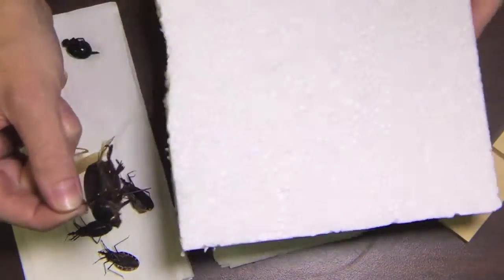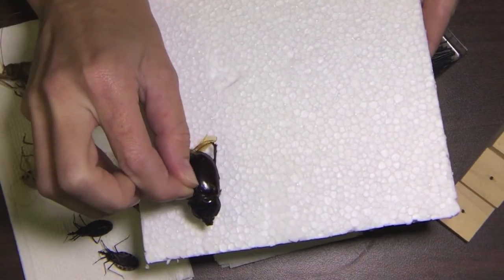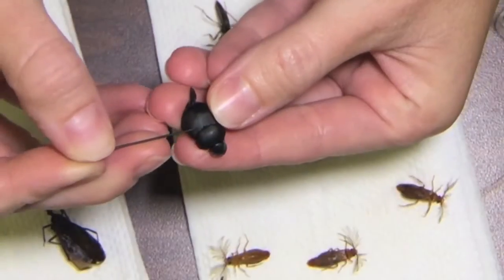Then I place it in my styrofoam just a little bit so that he's secure, but you don't want him mashed all the way down.